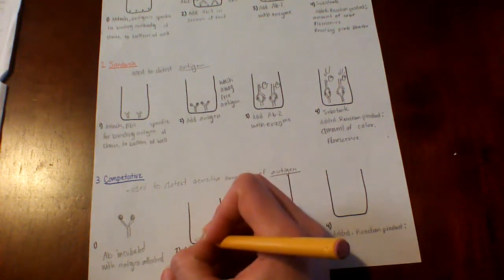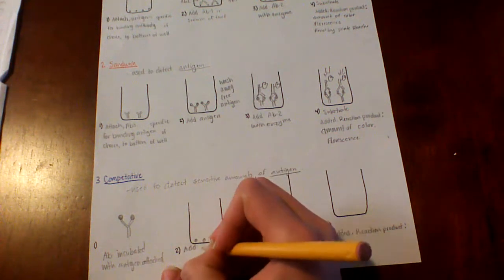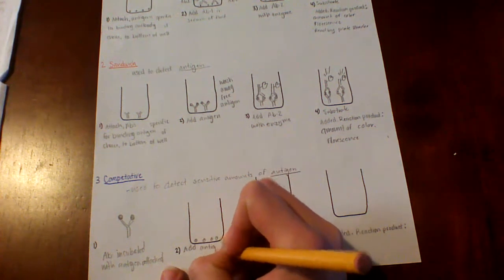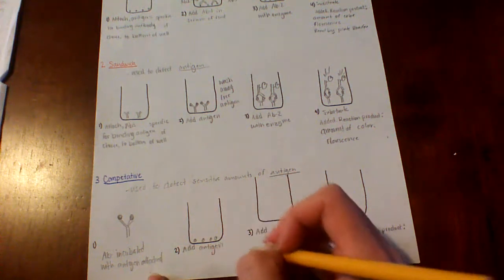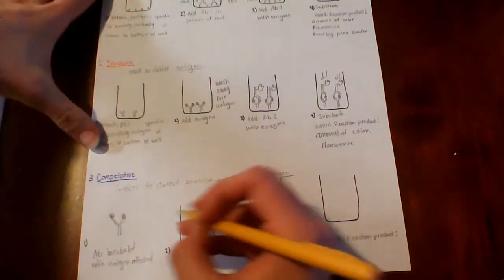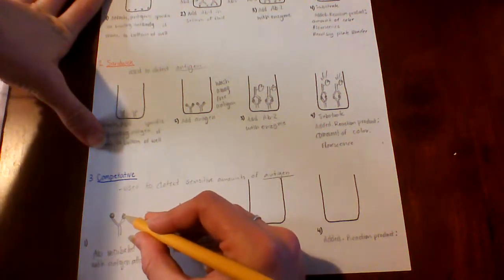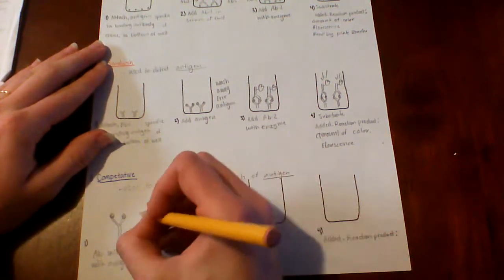So in step 2, it's coated with antigen. So this antibody antigen complex is added here.